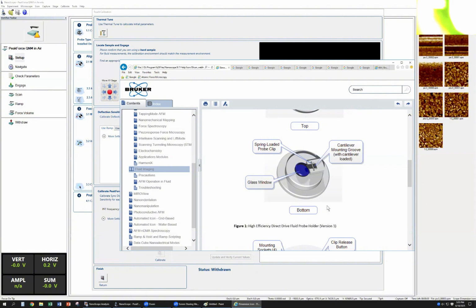a timber. You can call it the timber. You can use the glass slide. You can use, like, by left hand, glue the cells inside the bottle. Then next, you can drop the water inside. Then this one, just put it inside the box. Okay, so that's one.